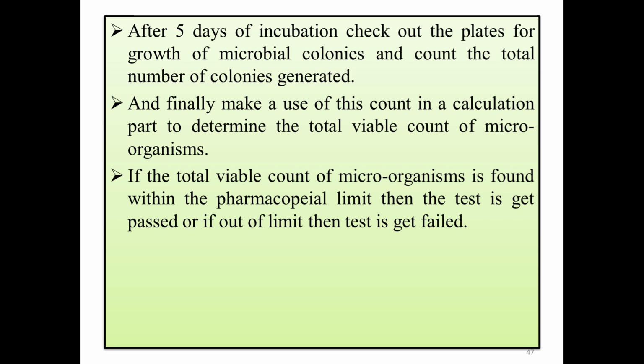Whatever microorganism is present in the nutrient media, then there will be growth of these particular microorganisms. If it contains microorganisms, after the specific incubation period, that is 5 days for this method, there will be growth of microorganisms in the specific agar media.